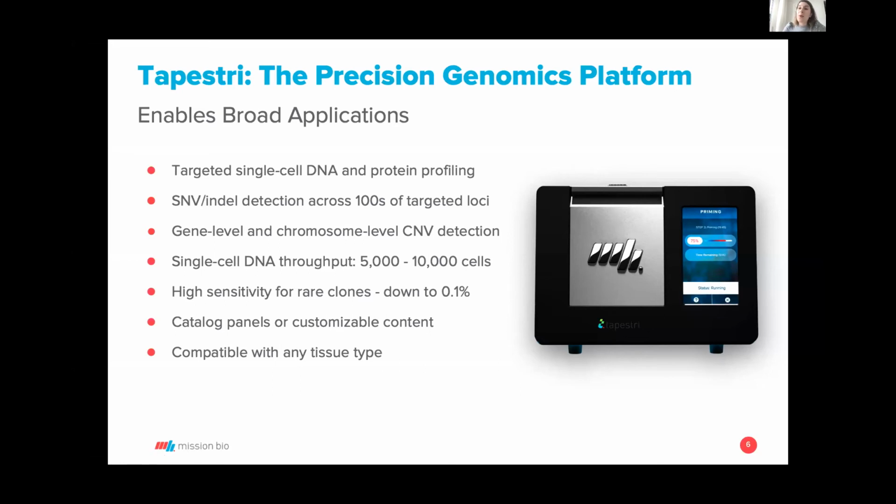But if you are working with multiple time points, such as in the context of minimal residual disease, if you determine one pathogenic mutation is important either at the time of diagnosis or at the time of relapse, it will show up in the other time points, such as the clinical remission, even if that represents one cell. And that could be 0.02%, for example.